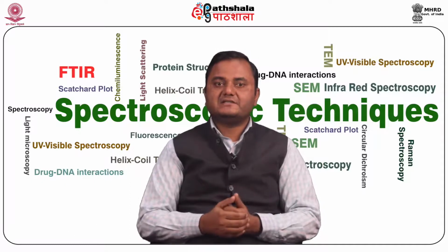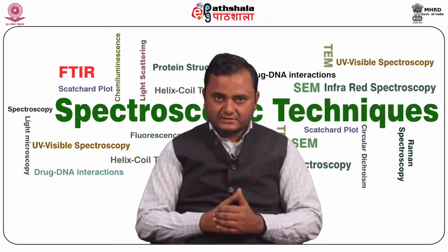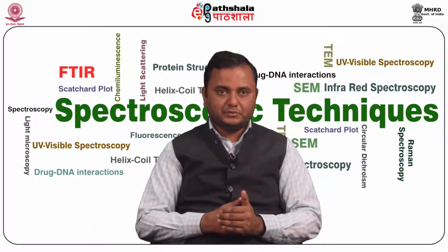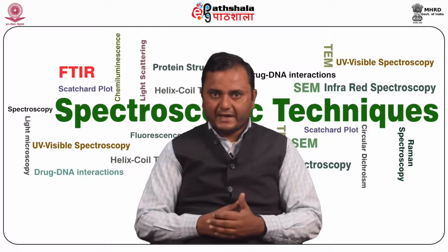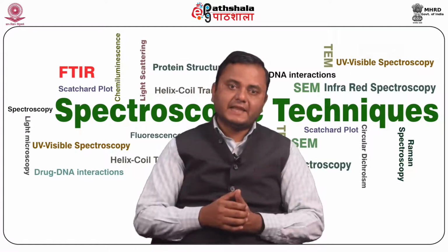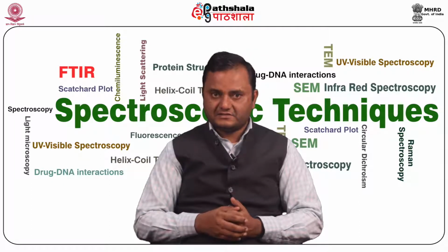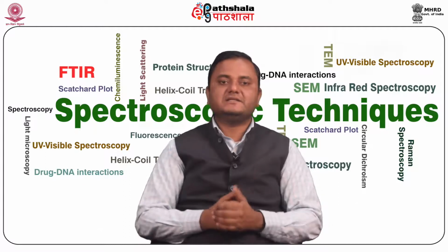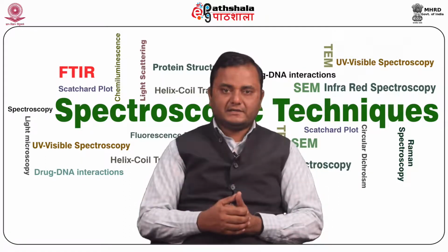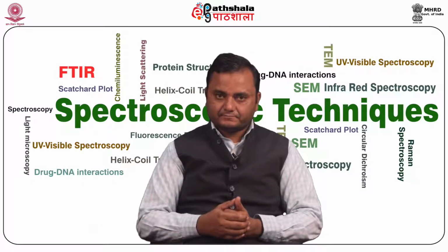The fifth advantage: no stray light in the FTIR. FTIR allows only the interference signal to contribute to the spectrum. The background light effect is greatly lowered, and it allows selective handling of signal-limiting interference. The sixth advantage is wave number range flexibility; it is simple to alter the instrument wave number range in FTIR.